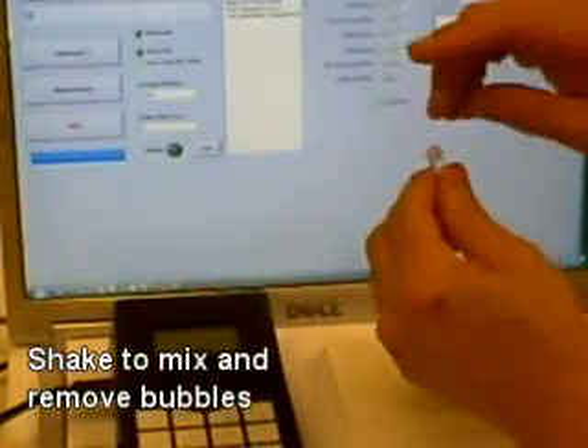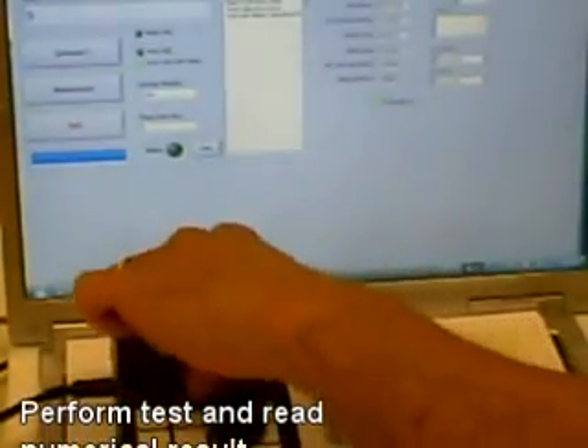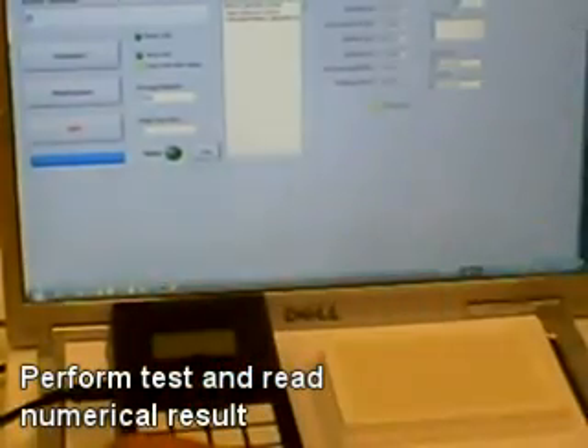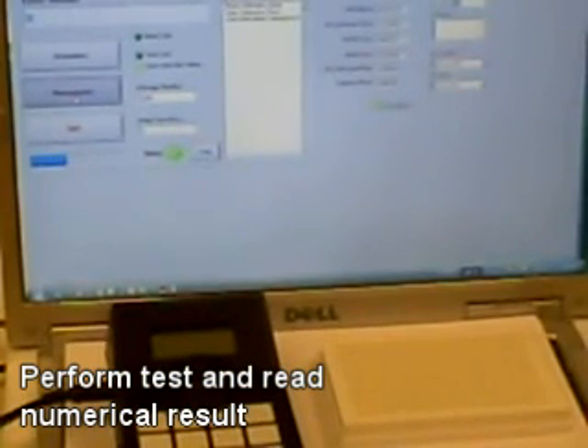Add enough drops of the reagent to refill the cuvette to about three-quarters full. Shake to dislodge any bubbles that are trapped. Wipe off the cuvette with the tissue and place the cuvette into the reaction chamber — the fluorometer — and click on the measurement button. You'll get the numerical reading which shows the detection of bacterial enzymes present in your sample, and the numerical reading relates to the amount of bacteria present.